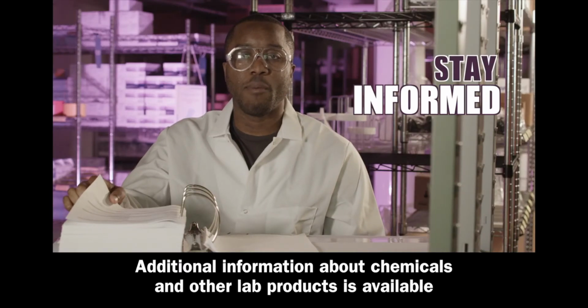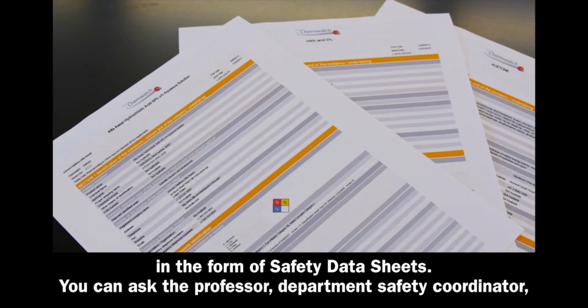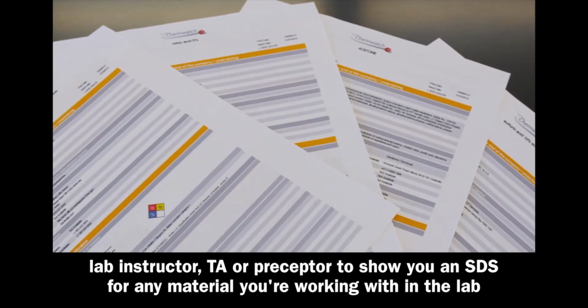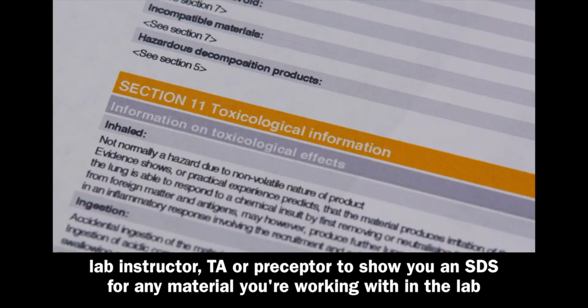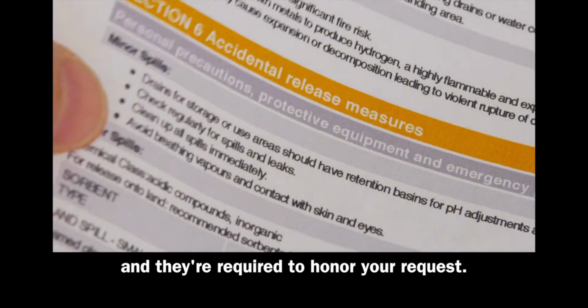Additional information about chemicals and other lab products is available in the form of safety data sheets. You can ask the professor, department safety coordinator, lab instructor, TA, or preceptor to show you an SDS for any material you work with in the lab, and they're required to honor your request.